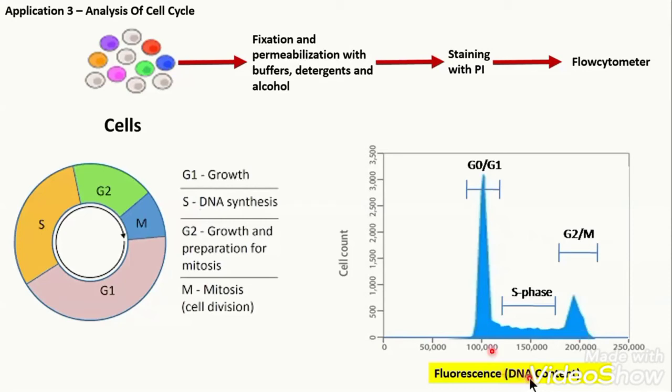What is the weight of this? And what is the weight of this? So based on the ink utilized and the weight of the paper including that ink, because if you have a bigger peak, there will be higher utilization of ink during printing and it will give a slightly higher weight. Then here some weight will come and here some weight will come. And based on the weight comparison, they were calculating the ratio of how many cells are present in G1, how many in S phase, and how many in G2. Amazing thing. I mean, people have evolved in science from very basic things to very high quality software. Nowadays, it takes 1 or 2 seconds to calculate the percentage: how many are in G0, G1, how many are in S phase, and how many are in G2M.